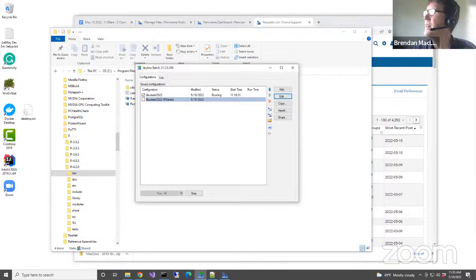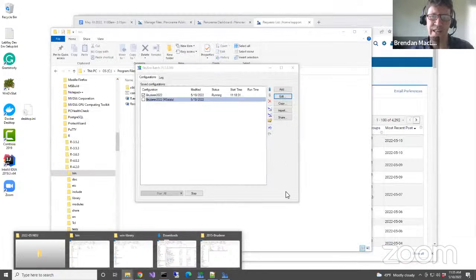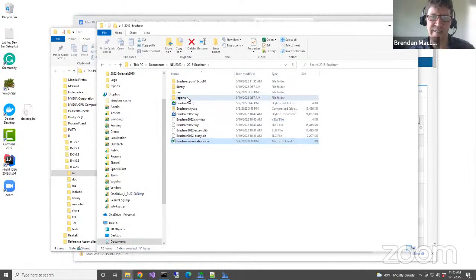Okay, so the question is, how can I make an IRT CSV file and what is in it? Generally you wouldn't need to, and you would just go ahead and choose one of the options. Like, I sidestepped choosing one of the options and went directly to importing that. I think that was to avoid a bug that hopefully is fixed, but I didn't have time to test it. But typically you would not need this.